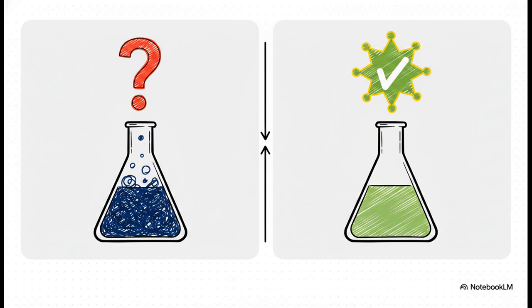On one side, we have sodium hydroxide. It's a strong base, but here's the catch. In this scenario, it's a secondary standard. That means its concentration naturally fluctuates over time, so we just cannot trust it on its own.